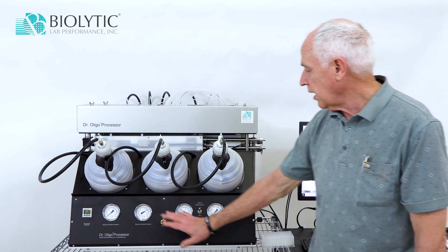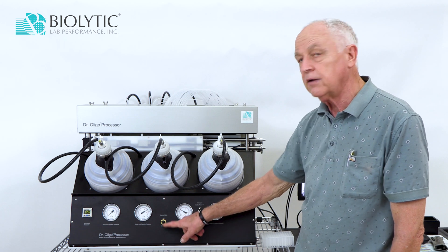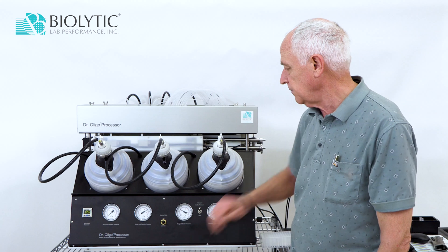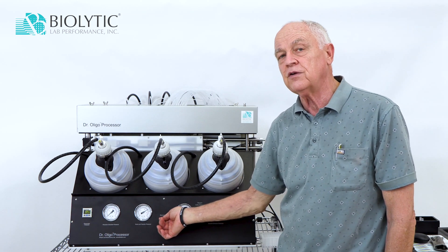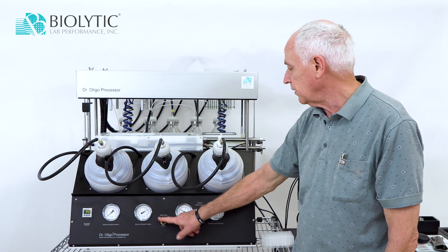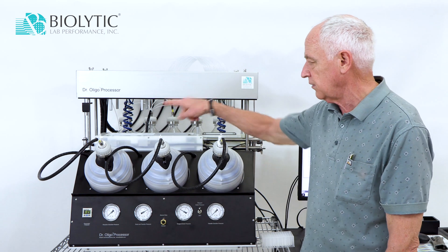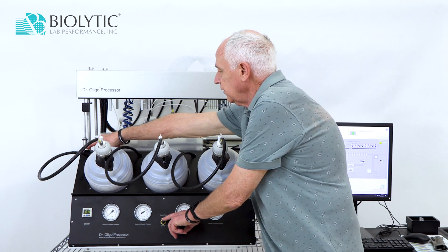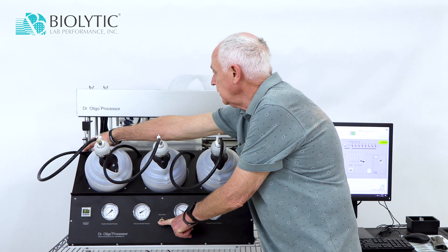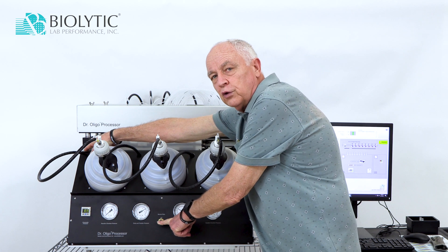We also have this switch which has three positions: up, center, and down. In the up position, it will raise the top section, which allows us to gain access to the inside of the instrument. Going down, it will lower this, but in order to go down you actually have to have this pressed and this down at the same time. It's a safety feature so that you don't have one hand stuck in there while the other one is lowering it.